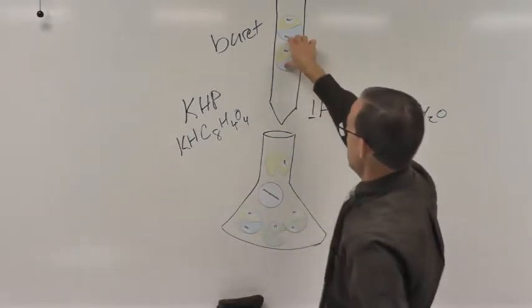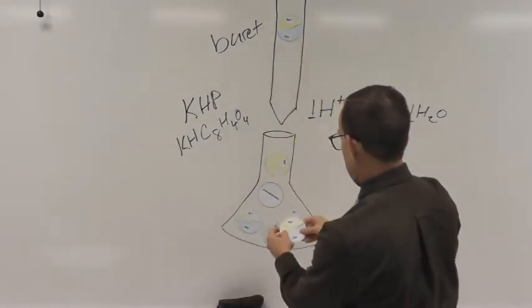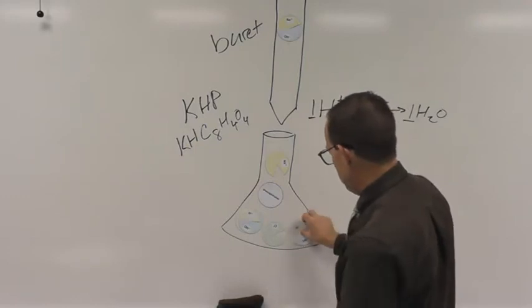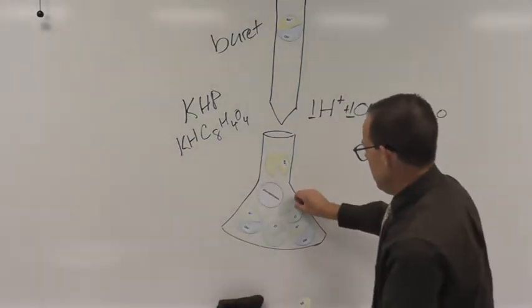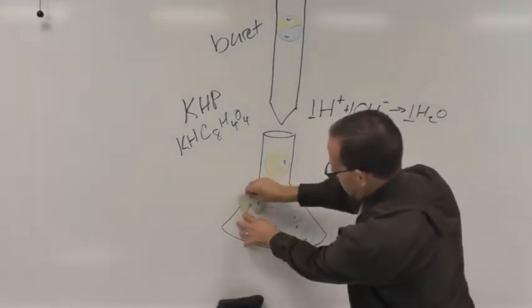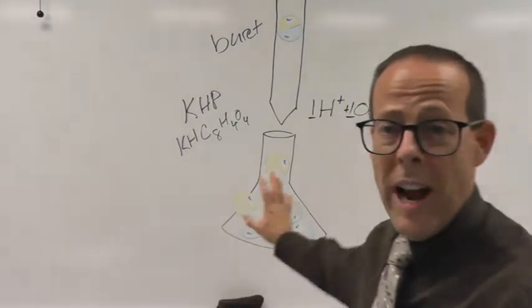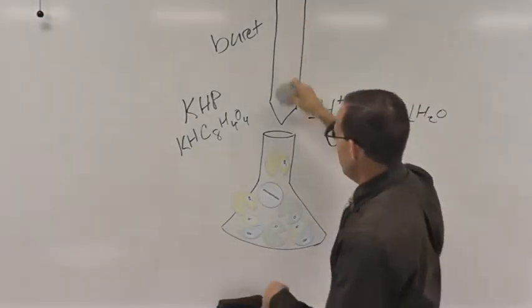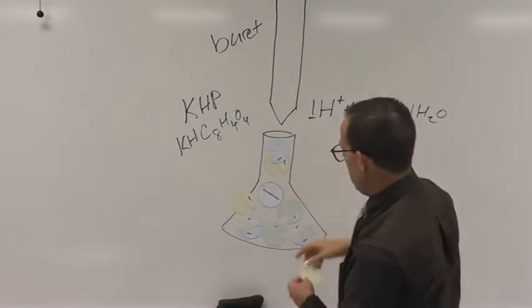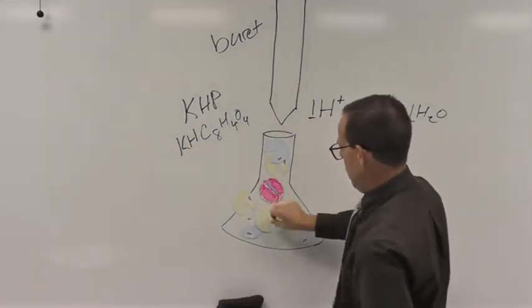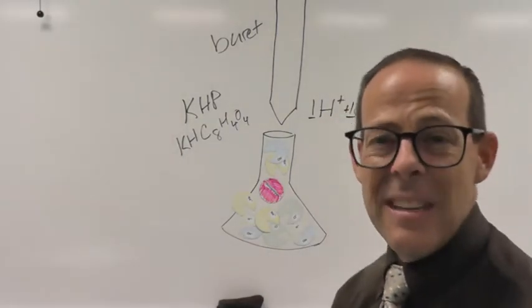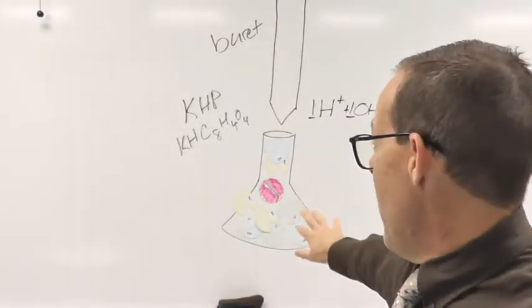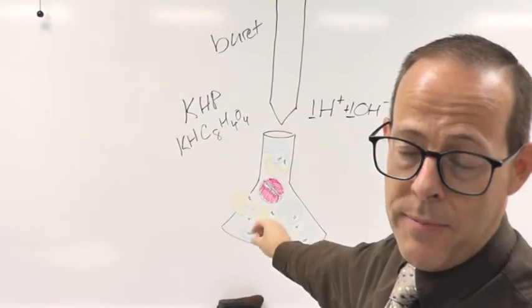I'm going to drop another sodium hydroxide into my flask. And notice, if you look at it, I only had two Hs down here, or eight Cl's down here, hydrochloric acids. So I've neutralized all of my acid at this point. So I have no more H plus in my flask, theoretically. So my next drop of sodium hydroxide is going to have nothing to react with. So I'm going to have basically this extra OH. That OH is going to cause my phenolphthalein to turn pink. So that is the end point of our titration. And I know all of my H is gone because there's no H to react with my OH. So the phenolphthalein ends up reacting with my OH, and we see a color change.